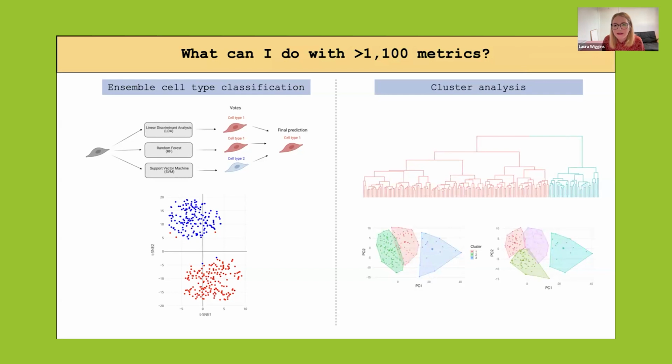As well as that, there are cluster analysis capabilities, so that's hierarchical clustering and k-means. And we do have a method included, which is the within sum of squares, so you can get an idea of how many clusters you can expect your data set to have. And then you can visually inspect the plots to see which clusters suit your data set best.